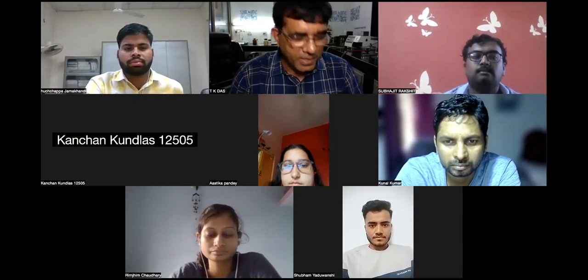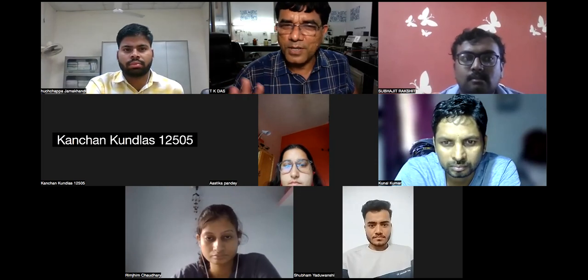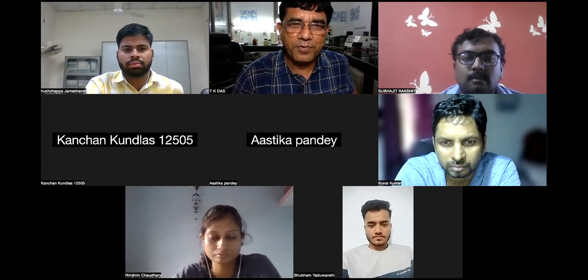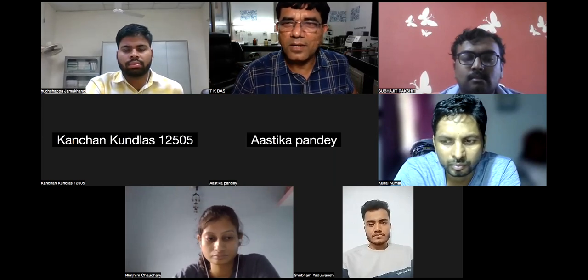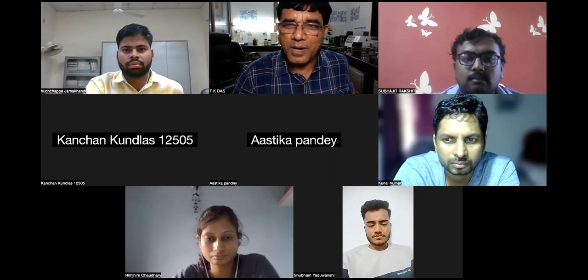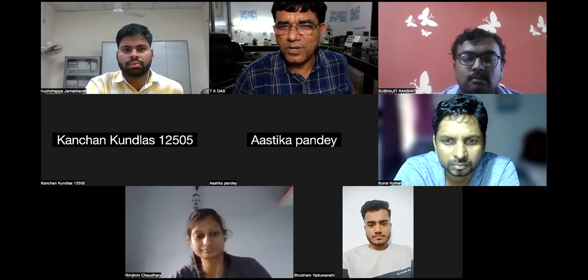No problem. We meet after, I will take just 20 minutes more, not more than that, because the available nitrogen practical by Subbiah and Asija, 1954, is a very simple method and very close to this method. So unnecessarily I would be taking it at some other time. So it is better to take that practical also, only for 10, 15, 20 minutes.